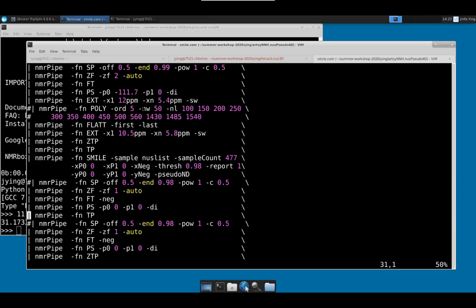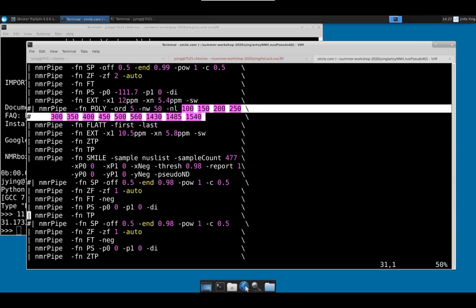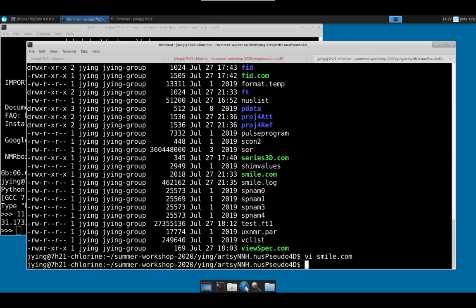Basically, I want to define the node list so that this program knows better what is baseline and what is not. In this case, you don't use auto. Auto means that it automatically determines the baseline. So you can go home and try something like this. Everything else is really standard over here, okay?